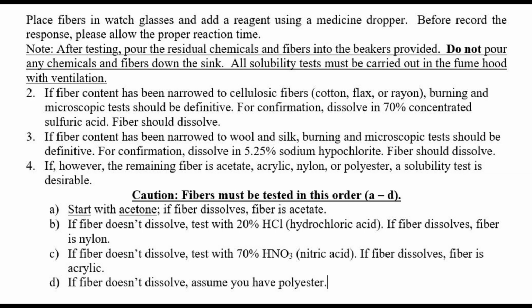In many cases, those first 3 tests, visual inspection, burn test and microscope observation, already give you a strong idea of the fiber type, but chemical tests provide confirmation.